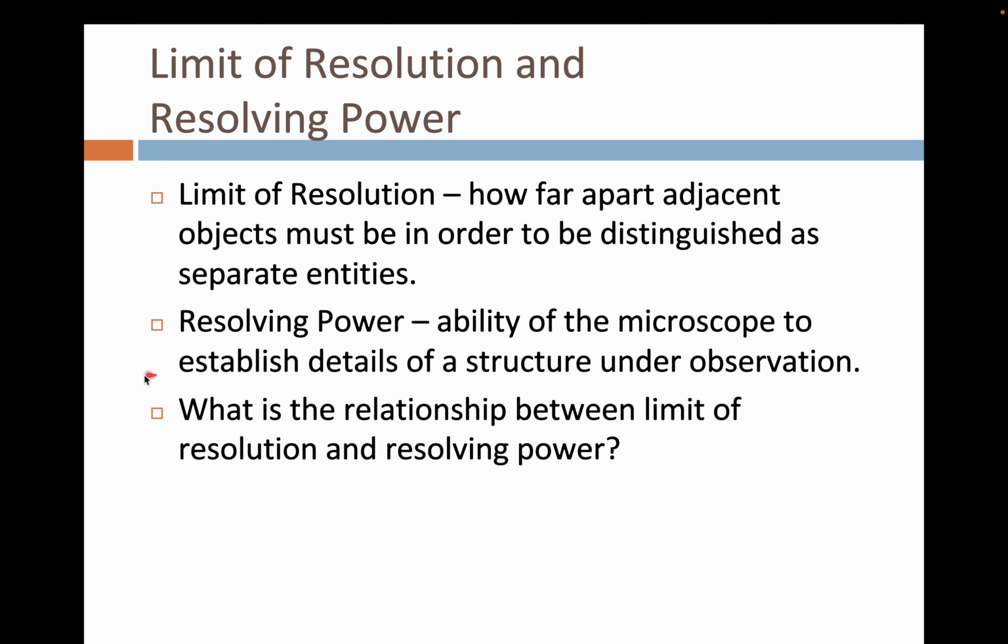Now, central question, a review question. I want to emphasize to everyone: what is the numerical relationship between limit of resolution and resolving power? As you answer the worksheet, you will encounter the formal definitions or more examples illustrating these concepts.